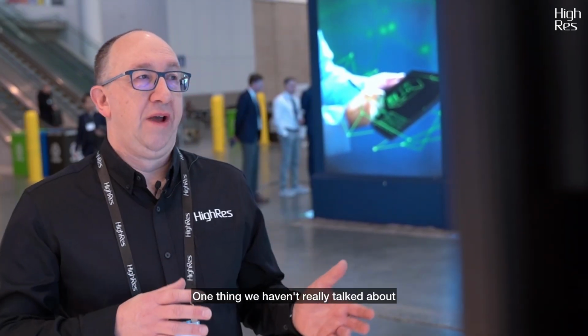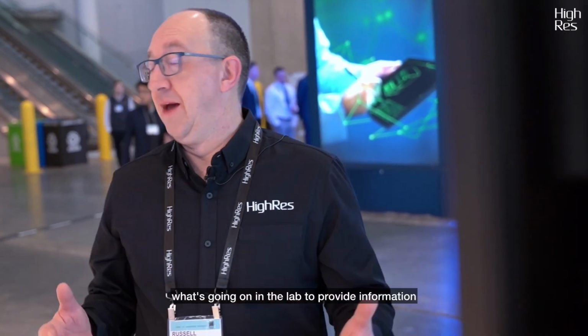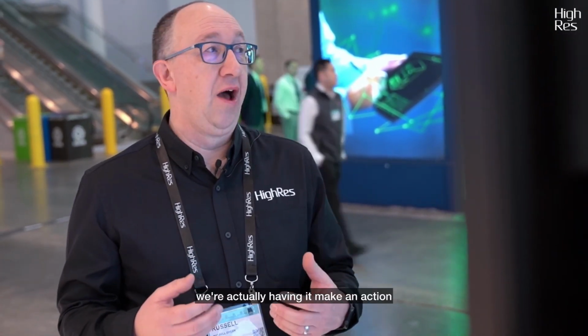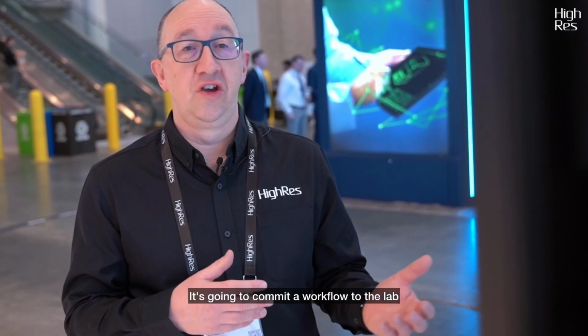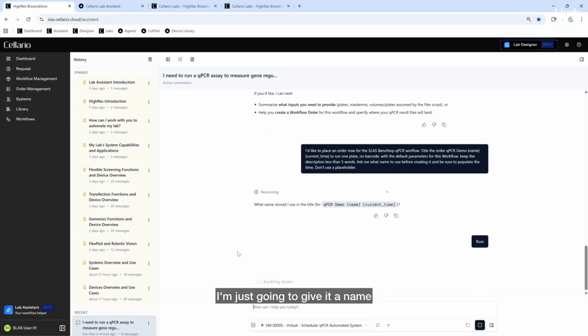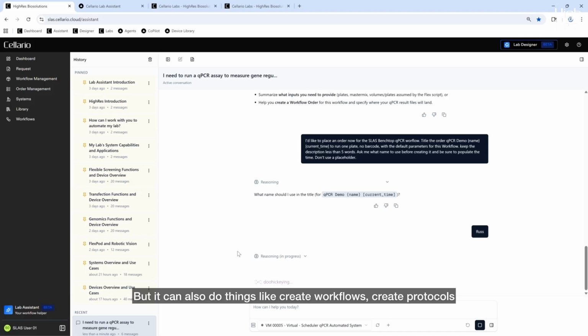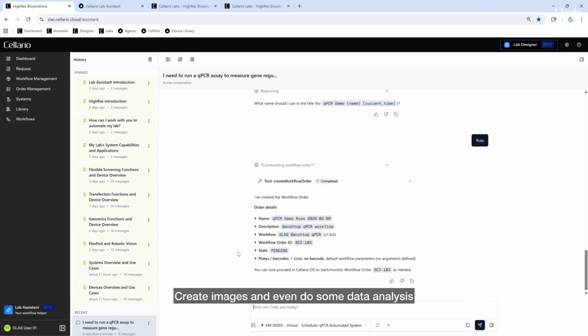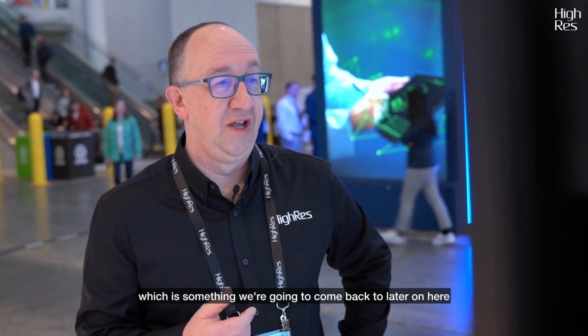One thing we haven't really talked about is that I've only used Lab Assistant to interrogate what's going on in the lab, to provide information. It can also do things. What do I mean by do things? In this case, we're actually having it make an action. It's going to commit a workflow to the lab. I'm just going to give it a name. But it can also do things like create workflows, create protocols, create images, and even do some data analysis, which is something we're going to come back to later on.